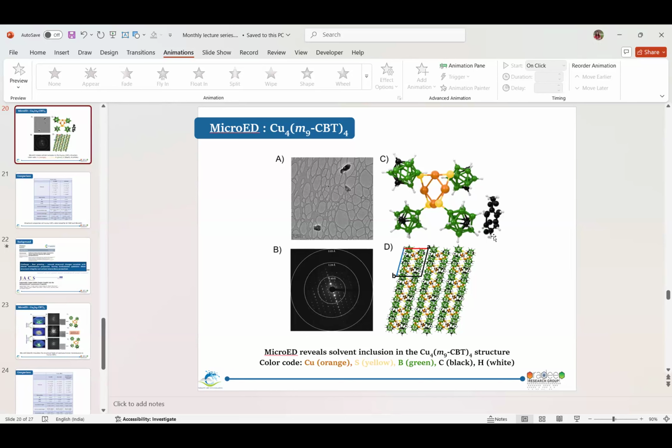Okay, Harshita, for a diffraction pattern like you can see here, I want to know three things. First, Soham also asked a bit, but I want to know what the radius signifies. Second, how many rings are there and what does that signify? And third, what does the distance between two concentric rings signify? These concentric rings are drawn manually in our software, EPU-D. If you see it in other software, it will just give you the diffraction spots. But to know the resolution, the software draws them in such a way that we can get an idea of up to how many angstroms these spots go. There is no physical significance of these concentric rings.